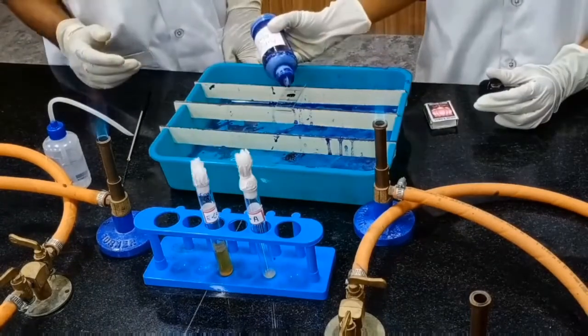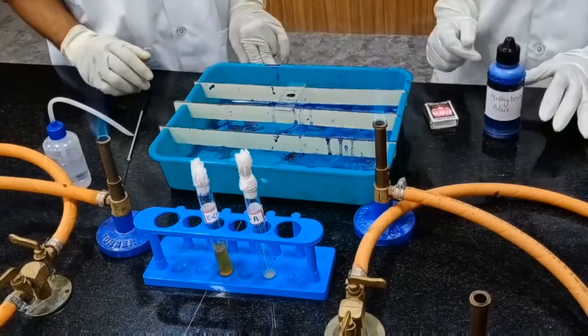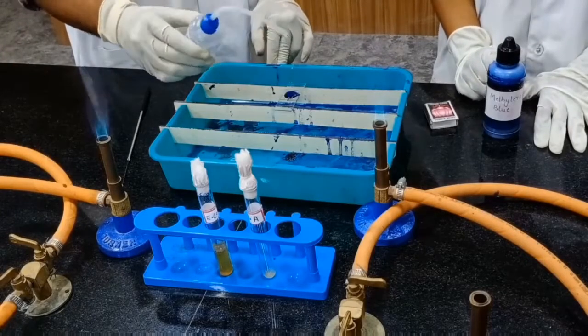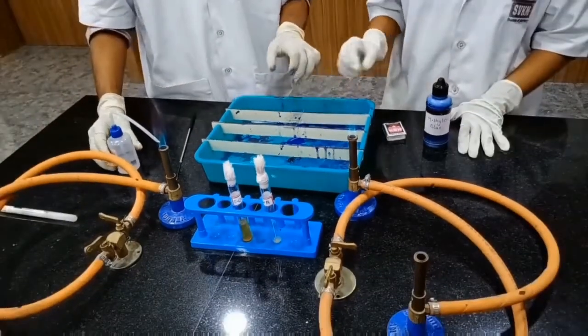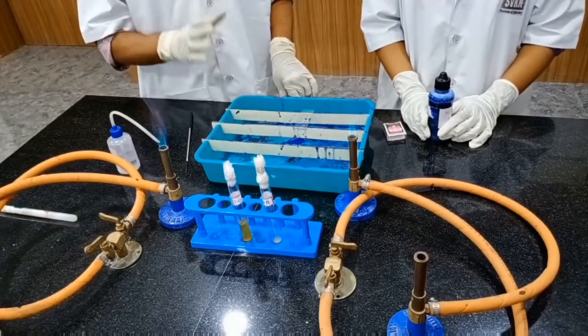We have to add methylene blue and allow it to react for 2 to 3 minutes. Then we have to wash the slide with distilled water. Then allow it to air dry and observe under 100x with cedarwood oil.